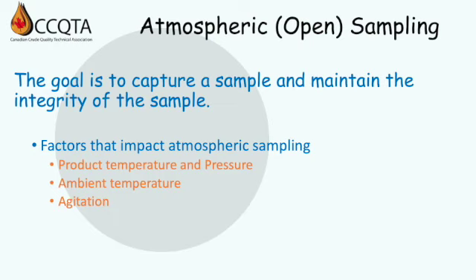Agitation. Remember that vapor pressure is a surface phenomenon, so agitating the surface by filling will promote evaporation because the surface equilibrium is constantly disturbed, and agitation also increases the surface area available to evaporate. And lastly, time. Evaporation and loss are also time dependent. If you're working with a very low flow sample point and take a significant amount of time to fill a container, then there is an opportunity for evaporation and loss. Sampling rate has to be balanced with the other factors as well, but should be kept in mind.